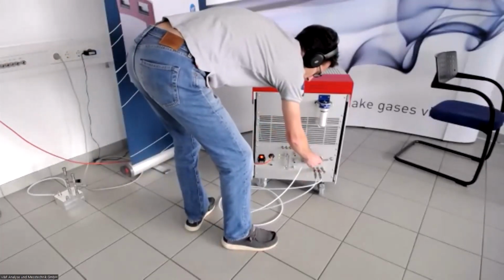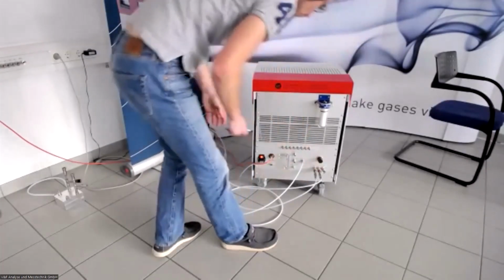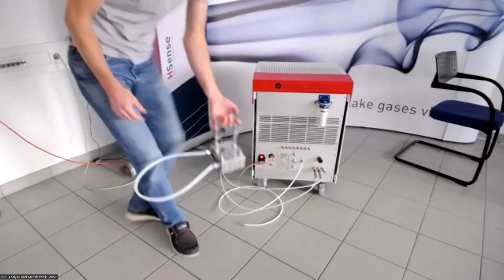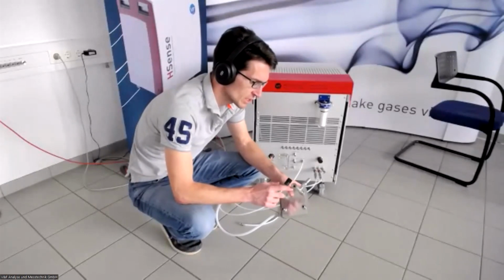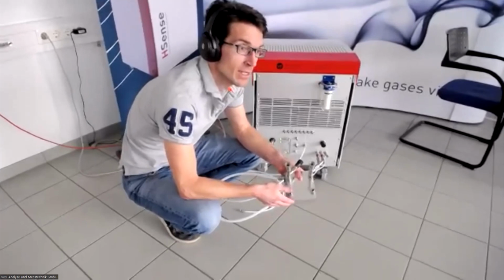Usually these Swagelok type connectors, you just tighten them with a wrench, not too tight. And here we have a small measurement chamber. You see, it's actually a very simple design. We have 2 inlet ports, where we will connect our nitrogen and hydrogen calibration gas.